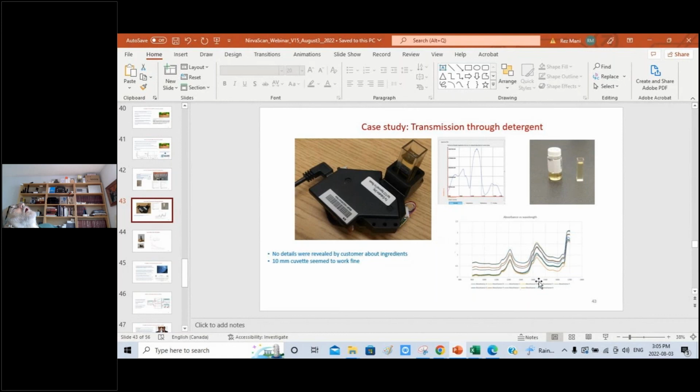There are many factors. I'm not exactly sure why this happens, but I've personally spent months sometimes trying to get a model working, and it was not giving good results. Then I found out that I was using a different instrument than what was used for the calibration measurement. When I used the same instrument, I got much better results. So we are working on solving this problem.